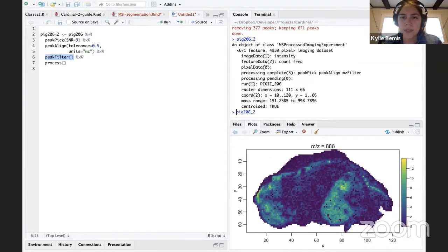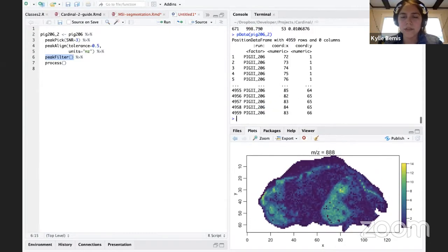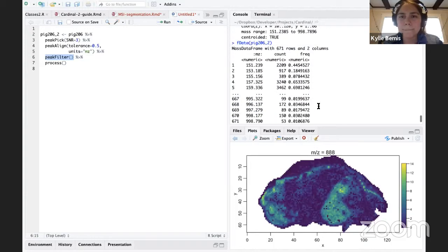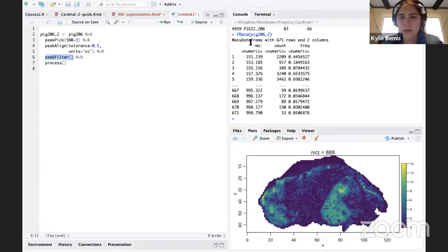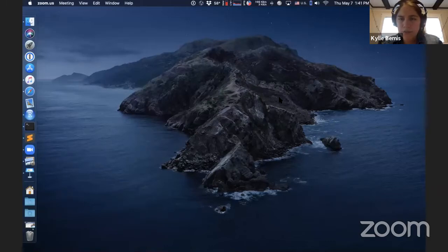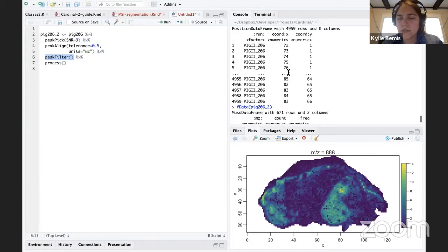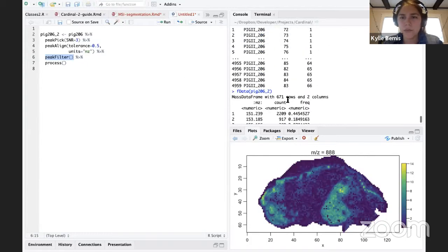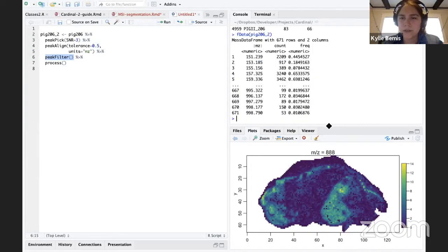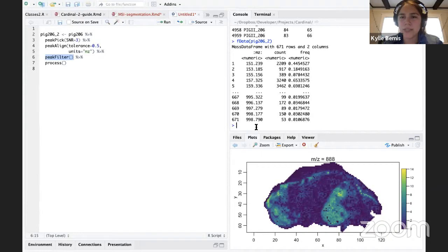And now I take a look in the pixel data. One quick note, you can use pData and fData as shortcuts for pixel data and feature data. Oh, wait a second, the question again. Image the number of peaks for each pixel. Oh, I see. Excuse me, I was accidentally calculating the frequency of each peak that was detected rather than the number of peaks per spectrum.